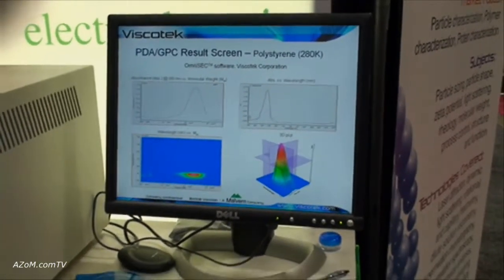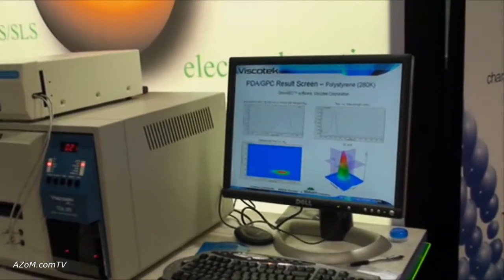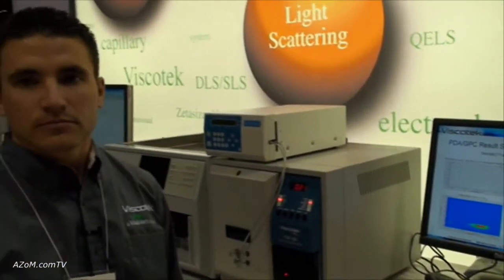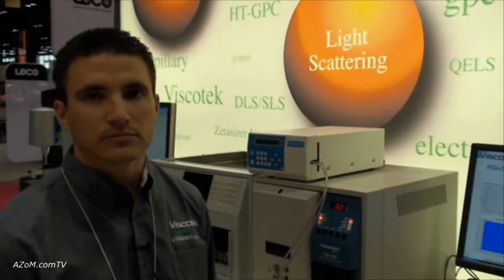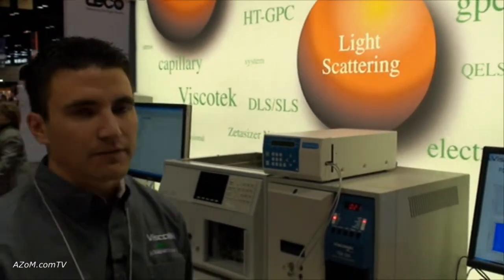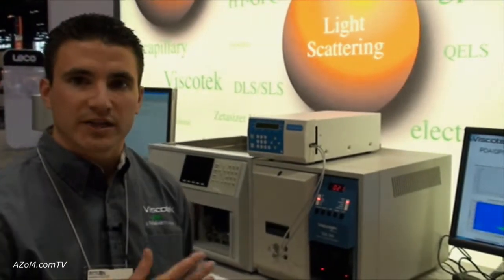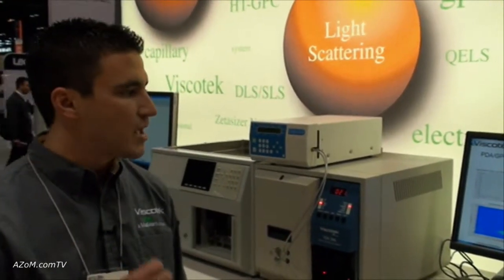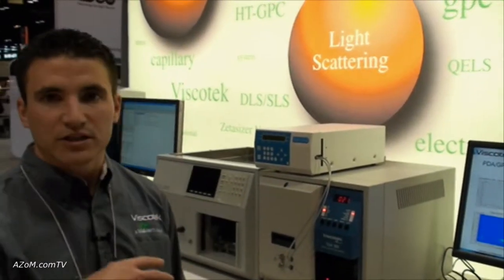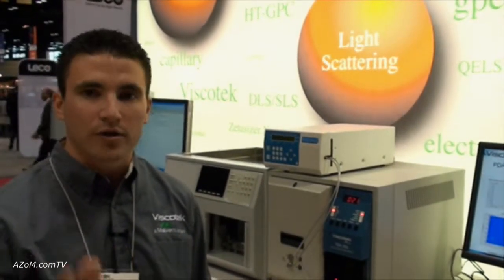This is used for characterization of polymers — you can take samples of random polymers and figure out what they consist of. People typically look for UV-Vis profiles in their samples to get some idea of the components. Instead of having to determine the wavelength ahead of time in batch mode, in a single injection you get all absorbance information at every wavelength across the molecular weight distribution.